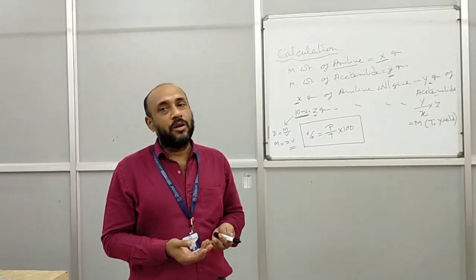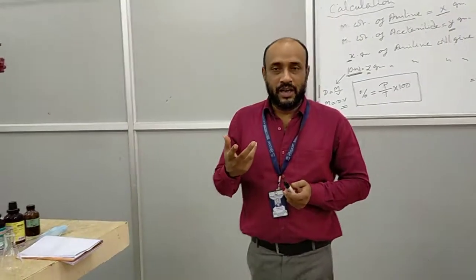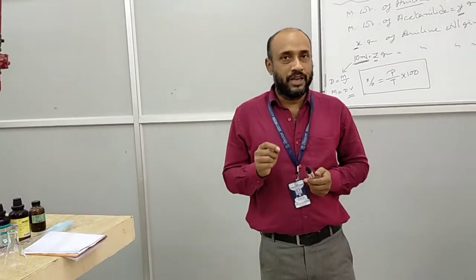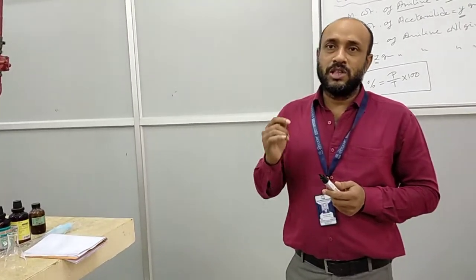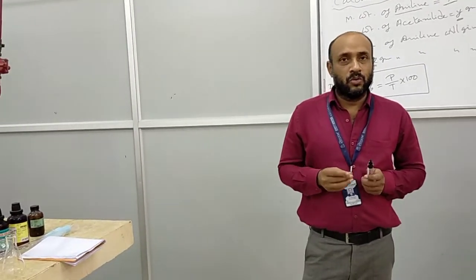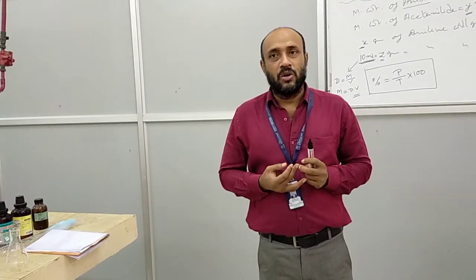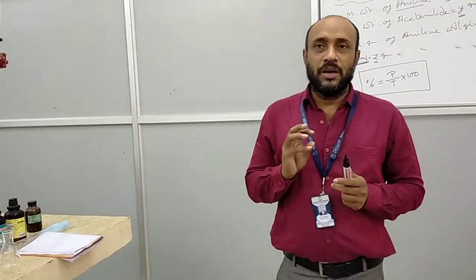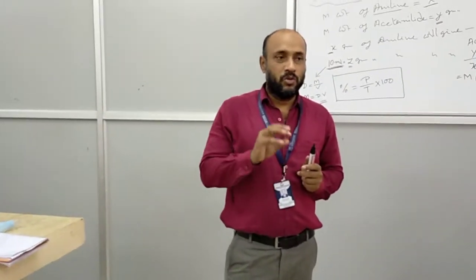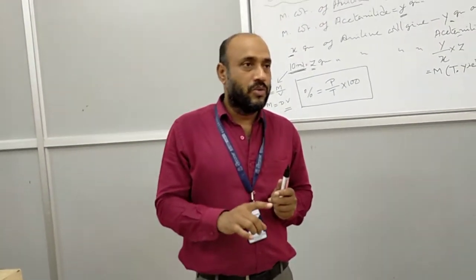air also, or by a hot air oven also. But whenever you use the hot air oven, always remember the melting point of that compound. Otherwise, if you keep the temperature more than the melting point, the product will not dry, it will be destroyed. That's why always remember the melting point of the product, and set your temperature below that melting point for drying purposes in the case of a hot air oven.